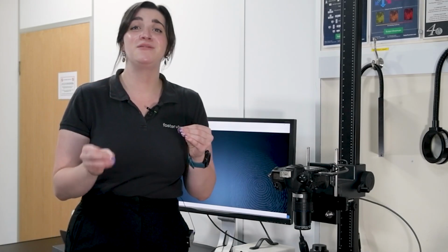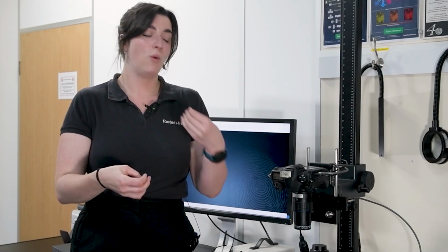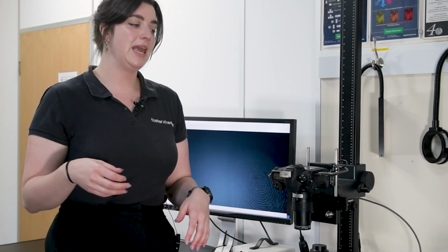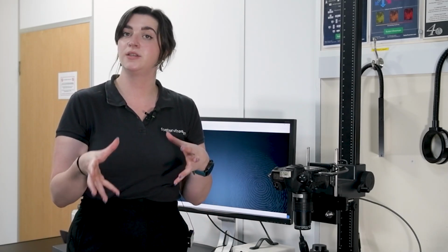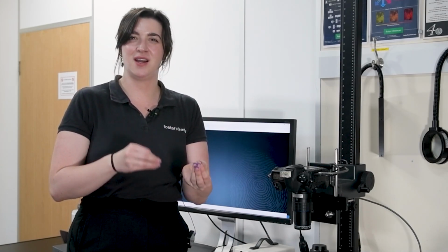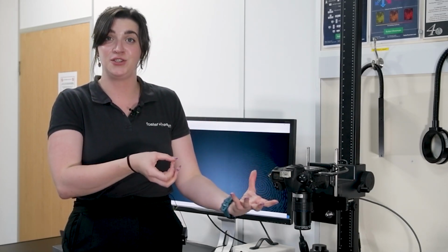But there's a couple of scenarios where those dye stains may well not help us. They might actually hinder us. So one such scenario, and the one that we will start by looking at, is fingerprints on a slightly porous or semi-porous background that may well absorb some of that dye stain. Normally, as I explained, what we're hoping for from our dye stain is that it makes the fingerprint fluorescent without making the background fluorescent, so that it's easier to photograph.